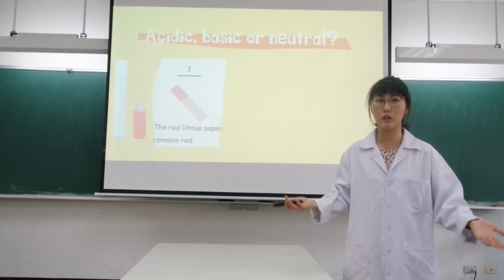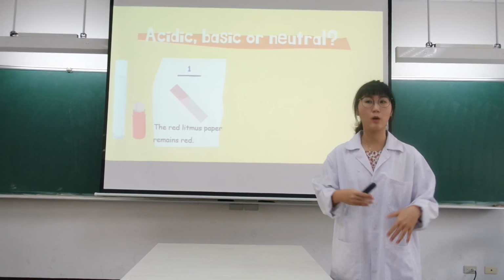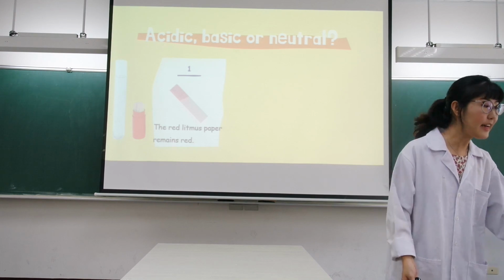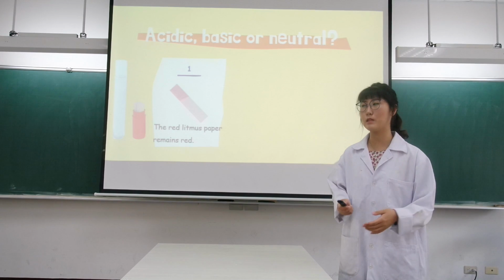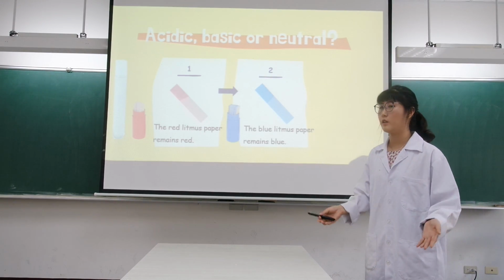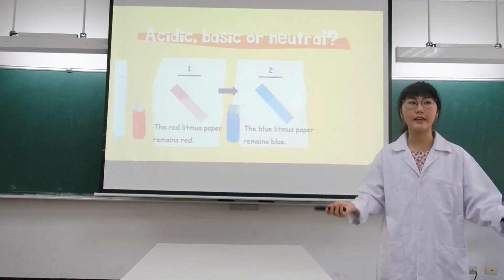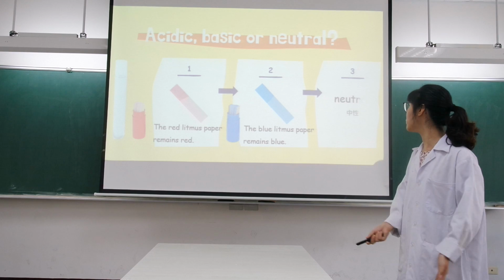Can we tell the results? All of you are shaking your head. We don't know, right? Then what can we do? Yes, Mary said we can use the blue litmus paper. The blue litmus paper remains blue. Then the solution is, yes, the solution is neutral.